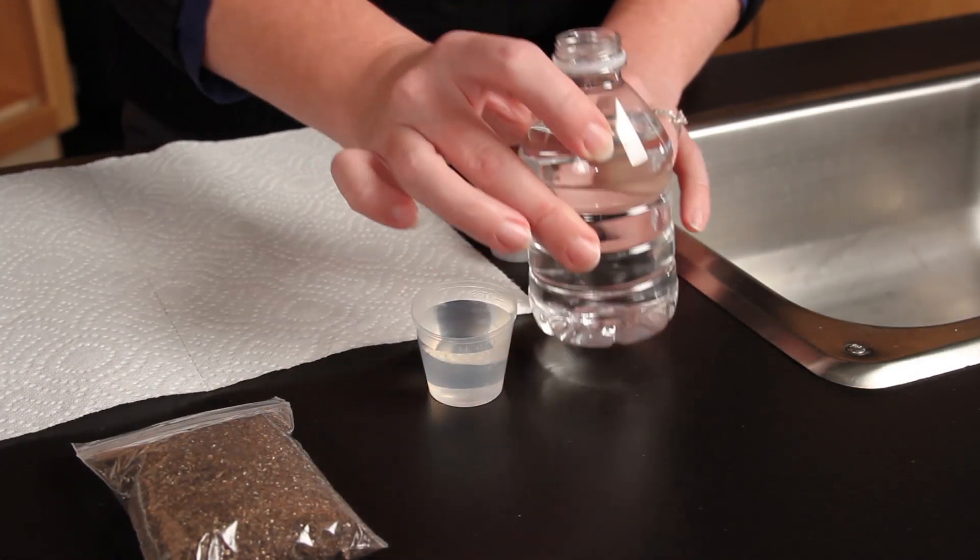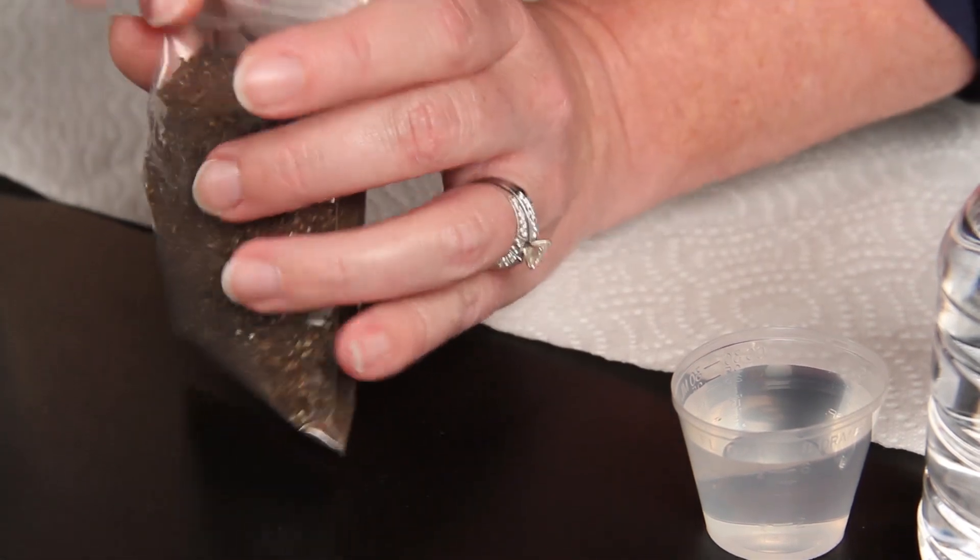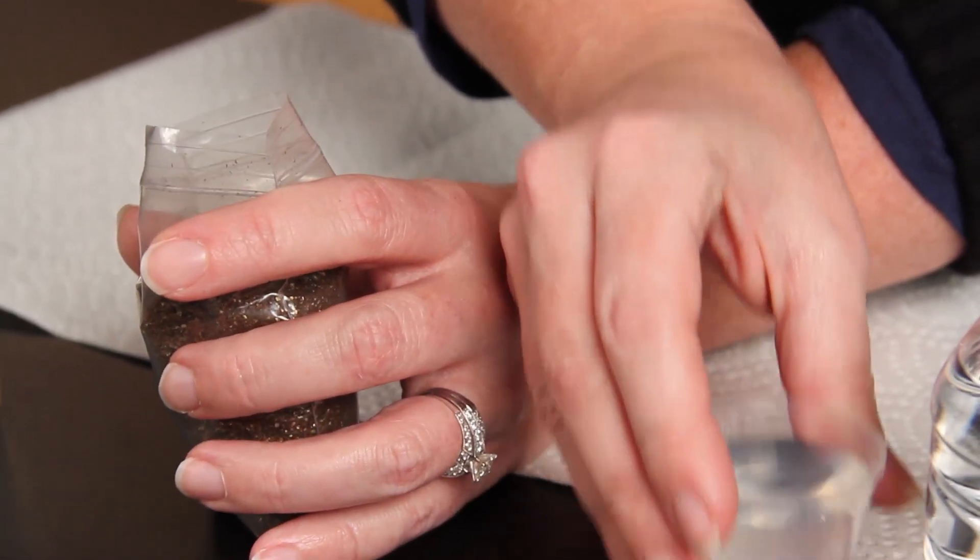Pre-moisten your bag of soil by thoroughly mixing in 20 milliliters of water to your soil.